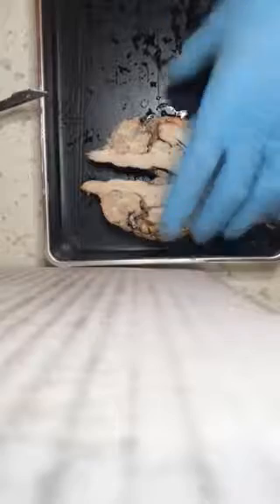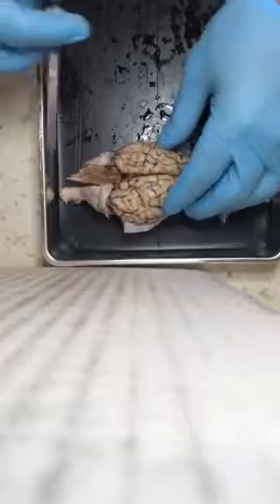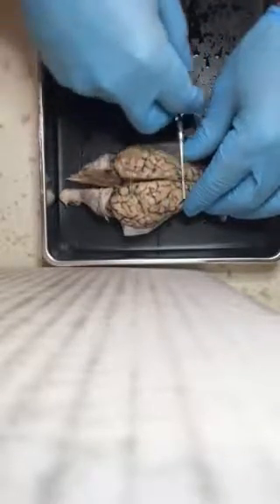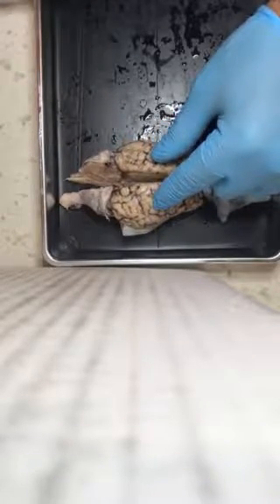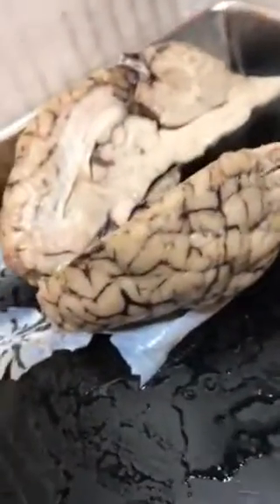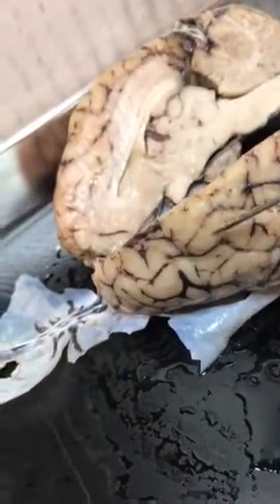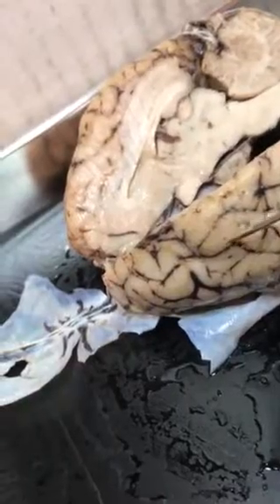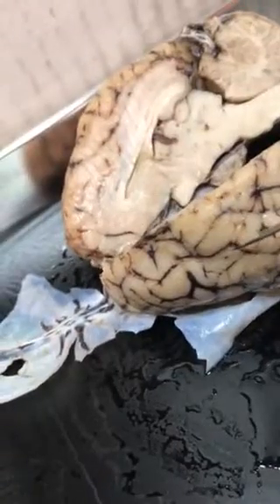Okay. So on the exterior of the brain, this part here is the cerebrum. So these two hemispheres are the cerebrum. For the sulcus and the gyrus, let me grab my phone. So here's an example. A sulcus and a gyrus, in a sense, are the valleys and the hills of the brain. So like this here, for example, is a hill. So this would be a gyrus, and these hills sink into the valleys here, which are the sulcus.